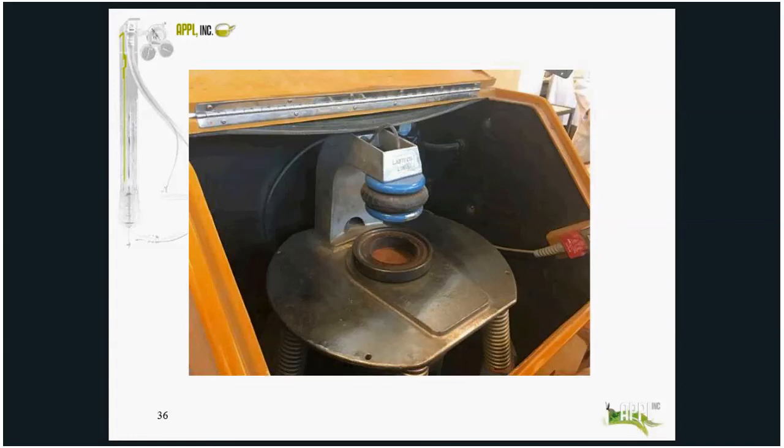And the grinding times can be adjusted to meet your data quality objectives. It's possible to overgrind a sample too. The soil can re-aggregate and form clumps, and in doing that, your incremental sample is messed up after the fact. And as I mentioned before, the ring and puck mill we use because it grinds the sample to a uniform size.